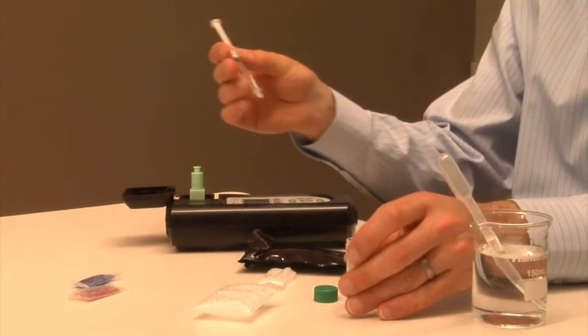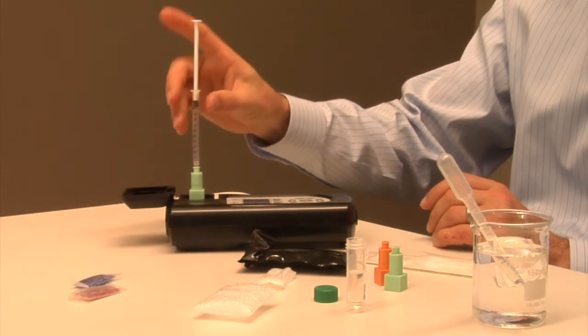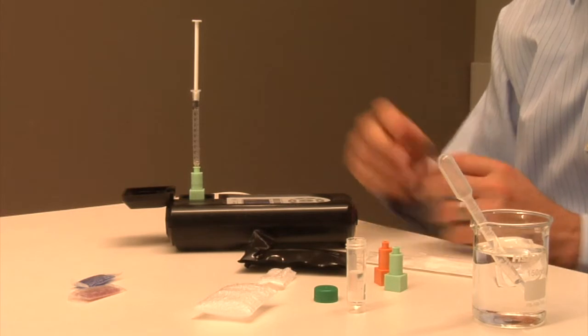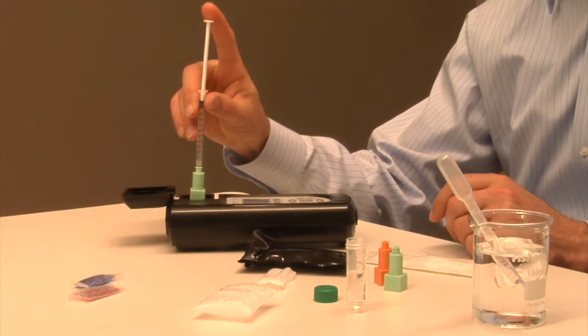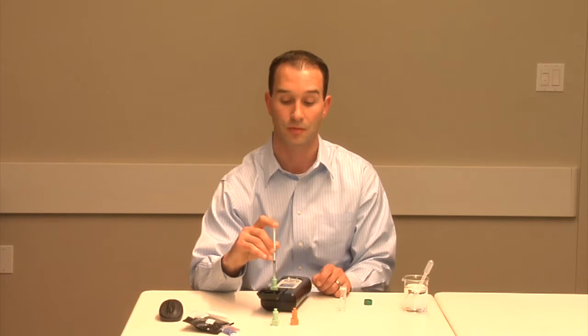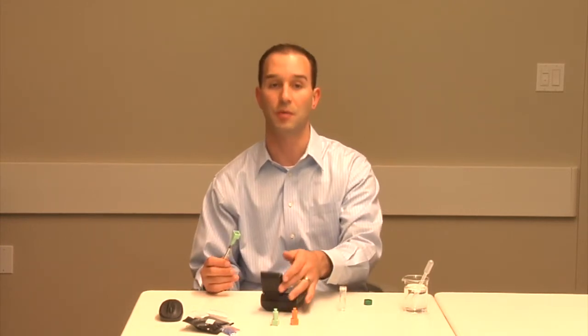Attach the syringe to the top of the sensor housing, over the cuvette in the instrument. The syringe will fit into the top of the sensor. Maintaining a constant speed, carefully squeeze the sample water through the housing into the cuvette. This should take 3 to 5 seconds. Too quickly, and the materials inside may rupture. Too slowly, and the reaction will have already started. The syringe and housing should be immediately removed and the sample door closed.